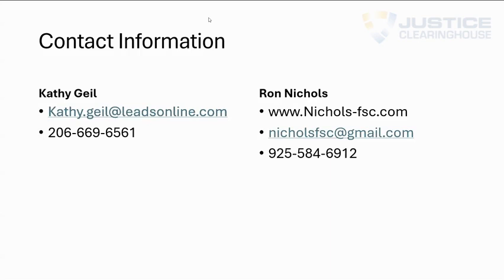Okay, we've got a couple other questions that just dropped in. Next one is, if the traditional light microscopy is inconclusive, but the VCM has a high confidence score, is it the expectation to report out an identification based on the VCM? Kathy, you want to take that one?